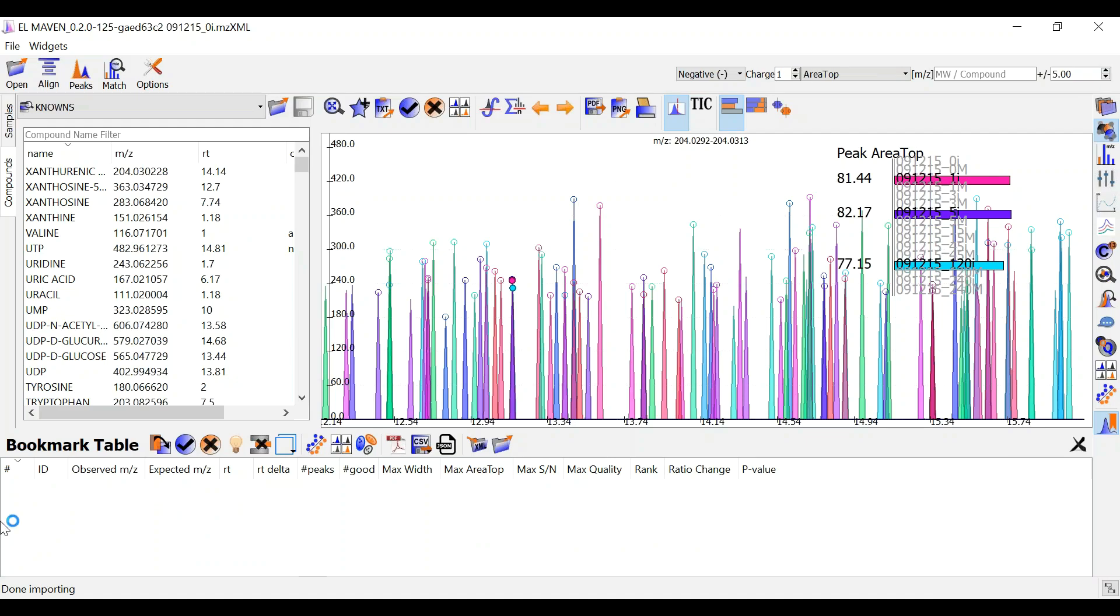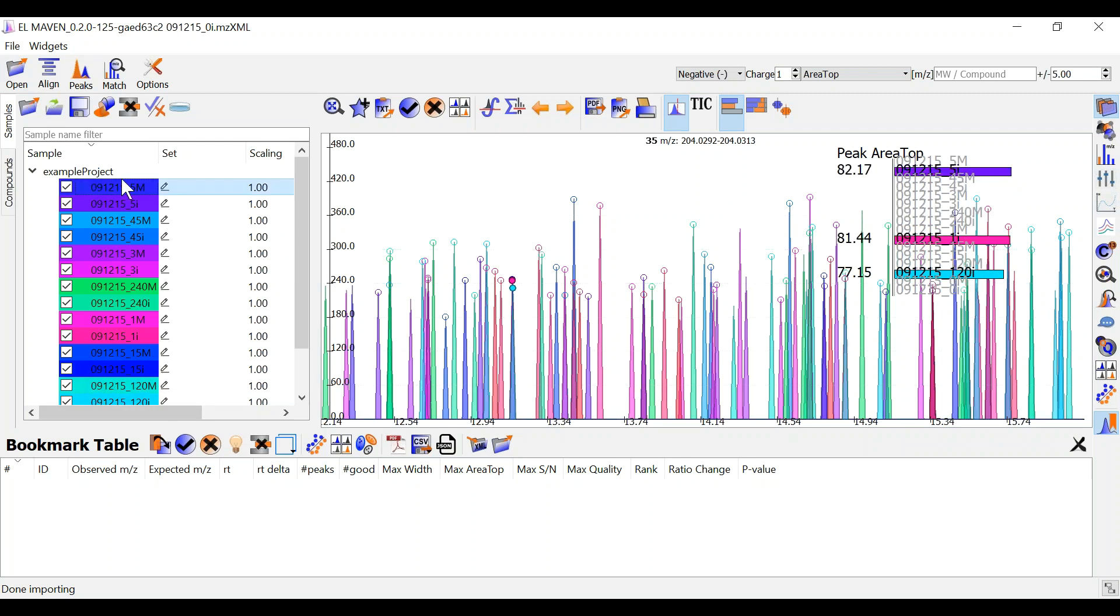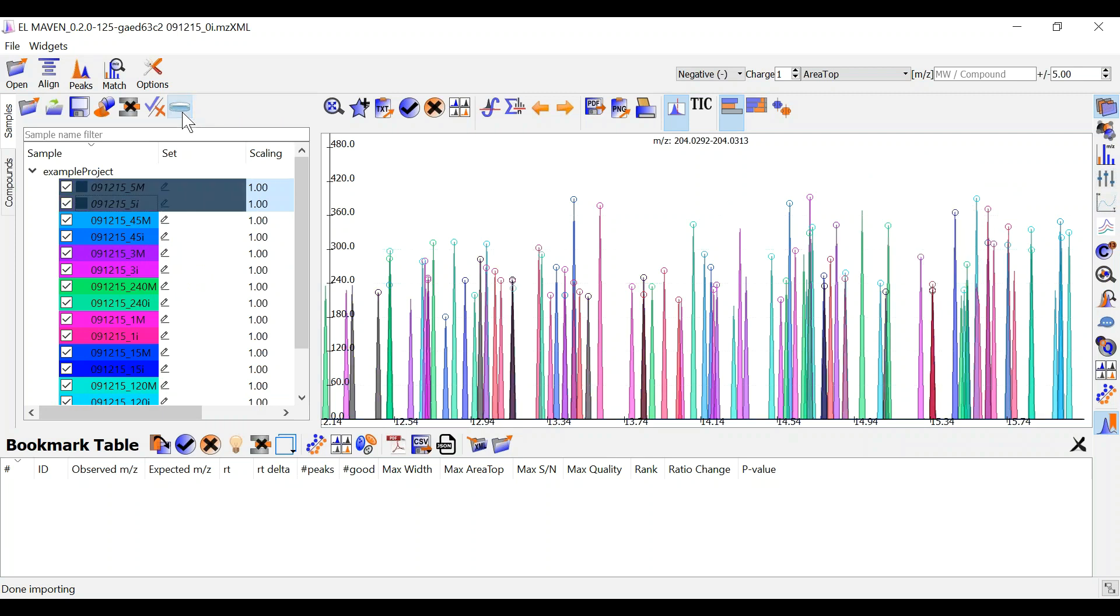You can mark some of your samples blank by selecting them. You can also select multiple samples and click on this icon to set them as blanks. This will mark them in black color so it's easier to differentiate from your other samples.